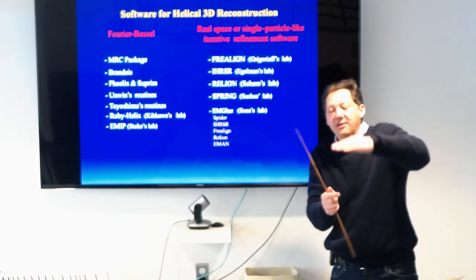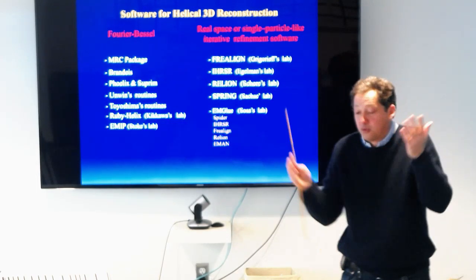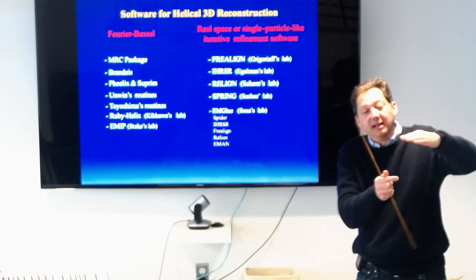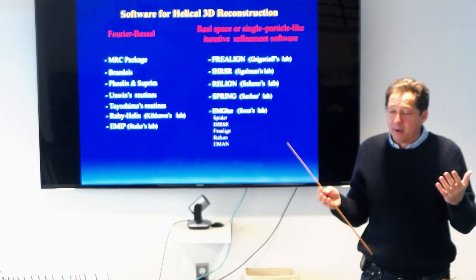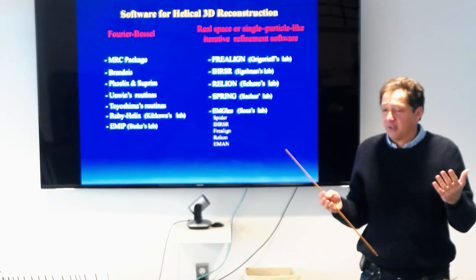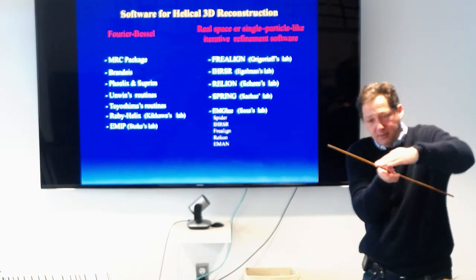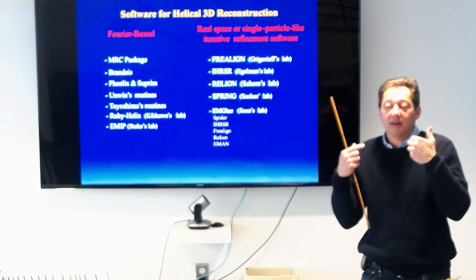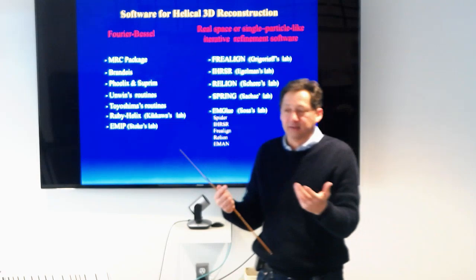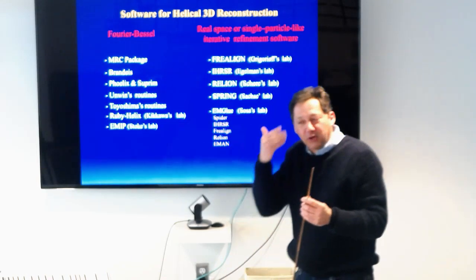Because it's only 5 angstrom, depending on it could be 2 or 3 pixels only. And then you are aligning your single particle set, and half of it is just the same particle, because sometimes it just comes down when you try to refine. So you have to adjust for these sorts of things. Okay, so that's something to keep in mind.